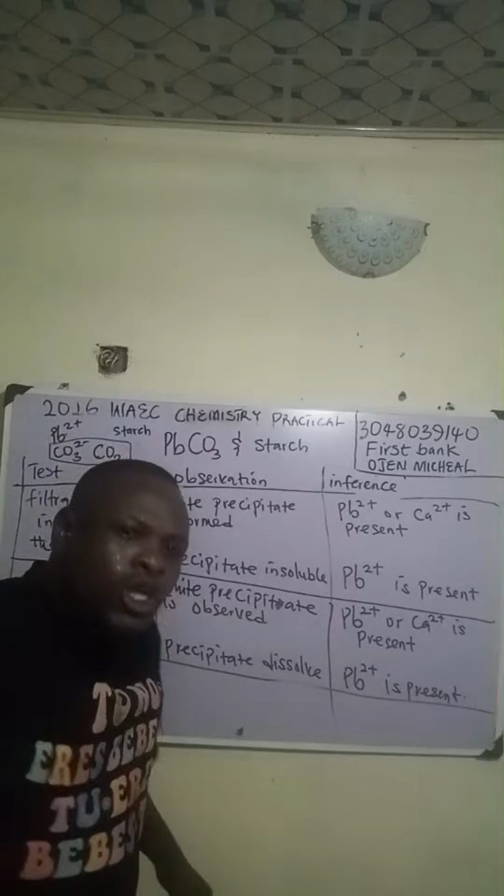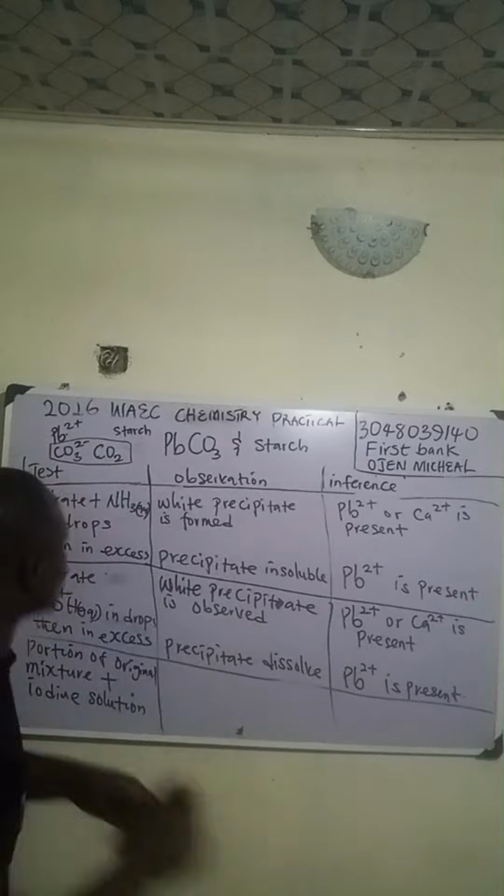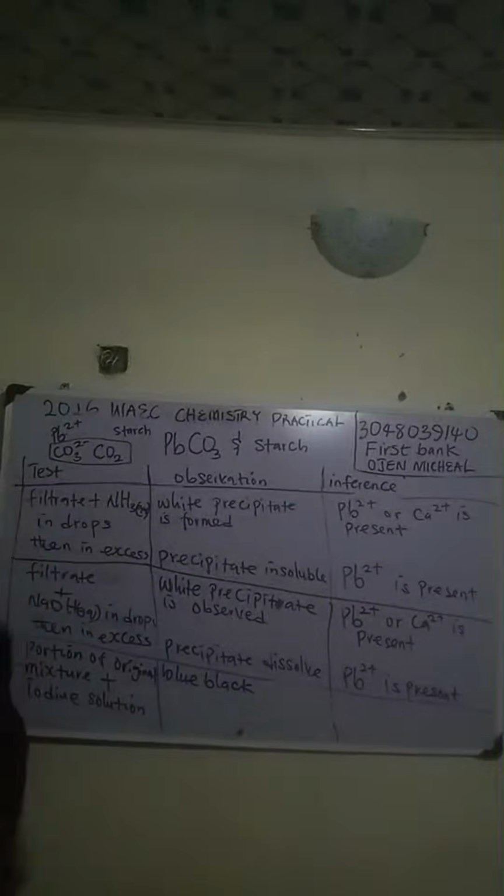When you get the portion, you test with iodine solution. If you test, what you are going to have in your observation is a blue-black color.